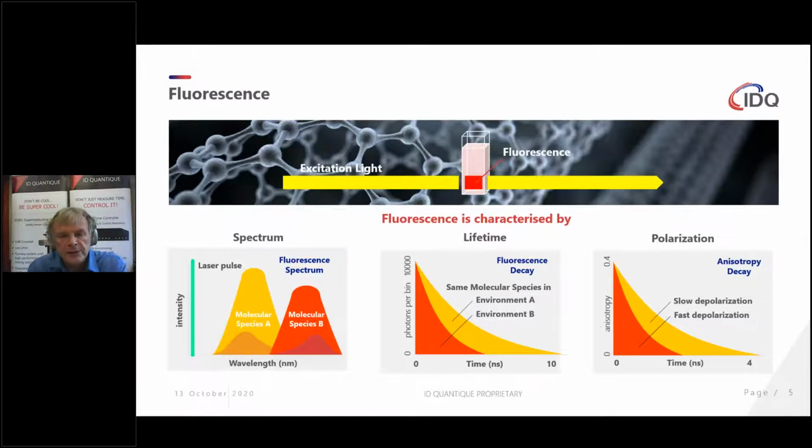So what is fluorescence? Well, when we see it with our eyes, we only see intensity. You can see based on the color, whether it's say blue-green or green, bright green or yellow-green, you can get a little bit of information about the spectrum. Those are both static measurements. But the other two out of those four parameters you cannot see.